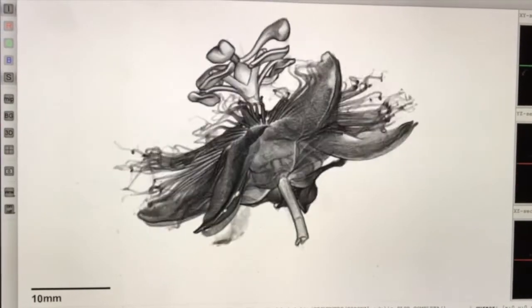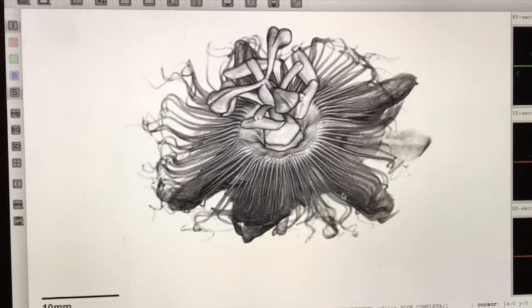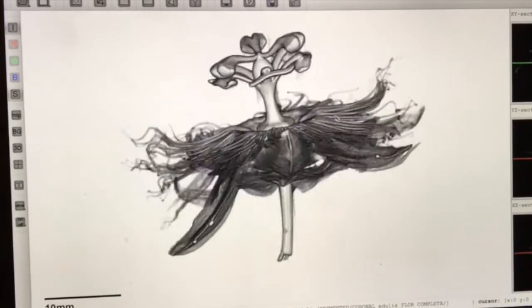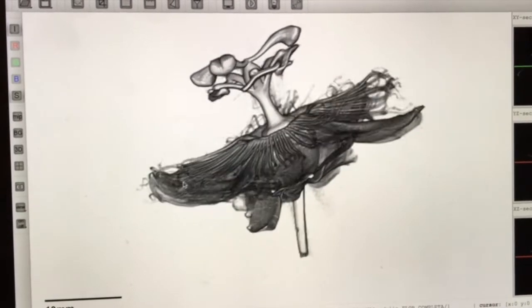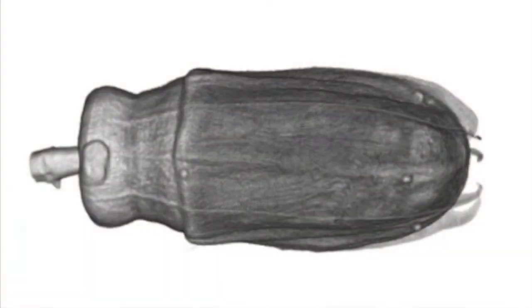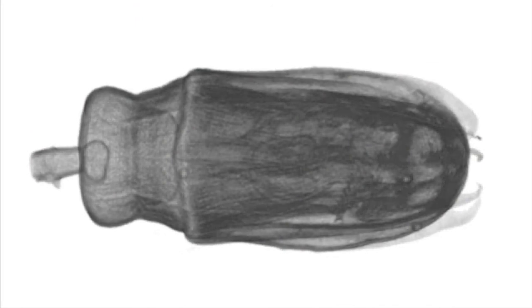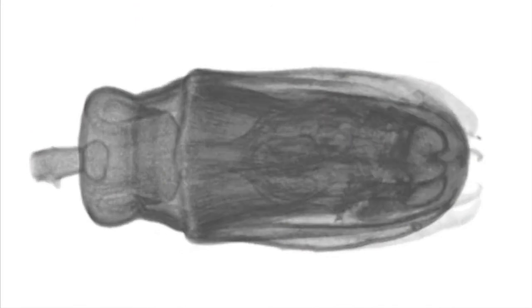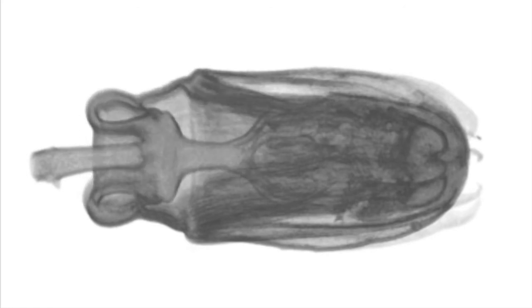Additionally, a stack of these virtual cross-sections can be combined by other computer programs to produce a 3D rendering of the object that was imaged. These 3D reconstructions can also provide information on the internal structure of the sample.